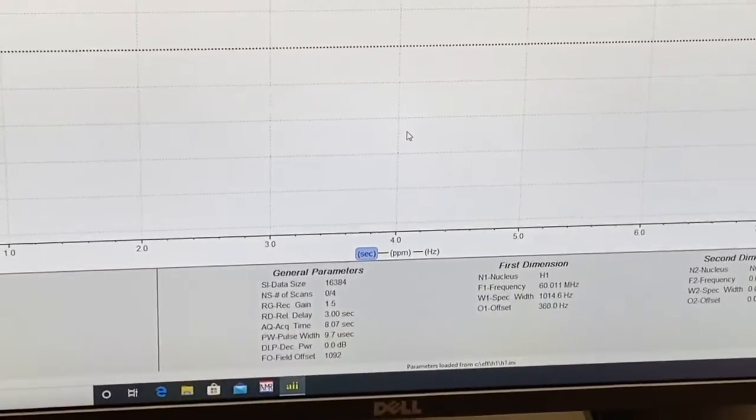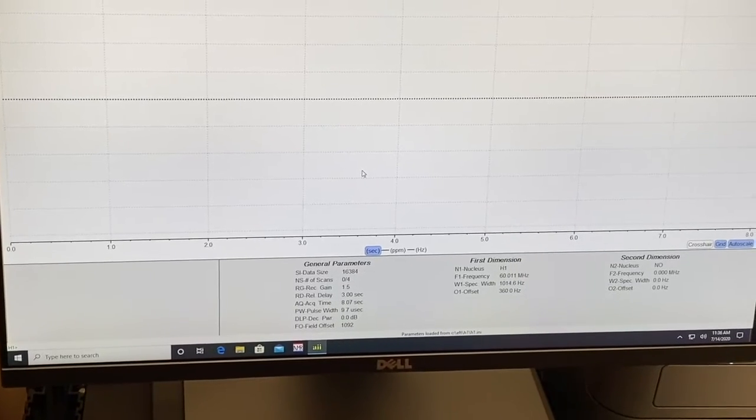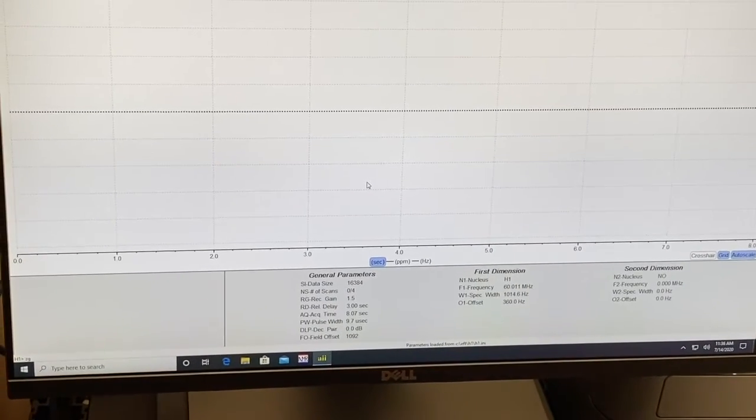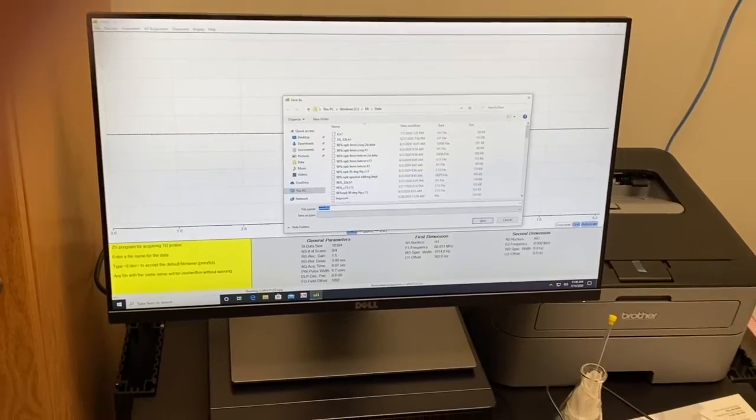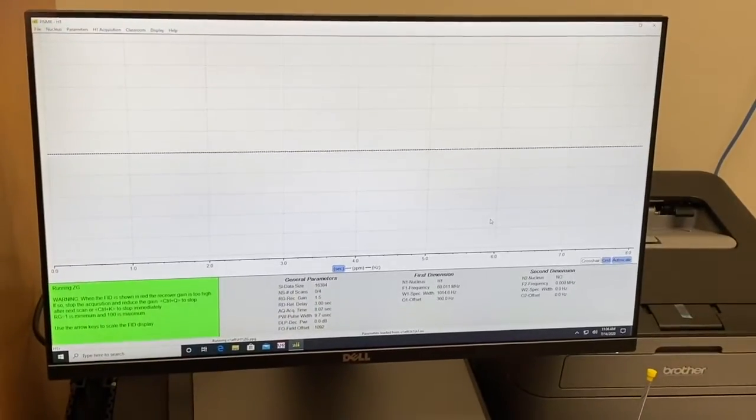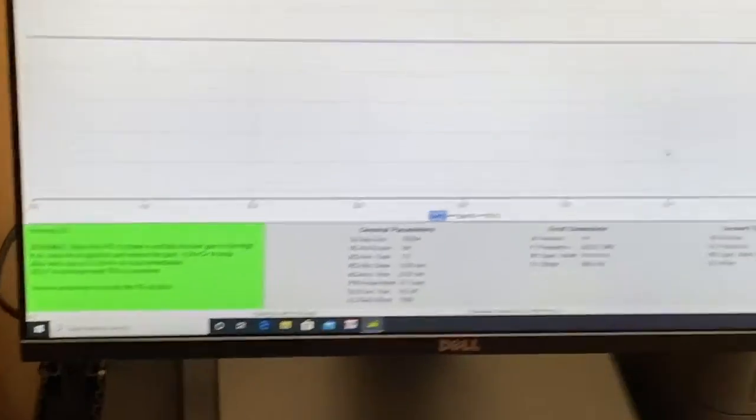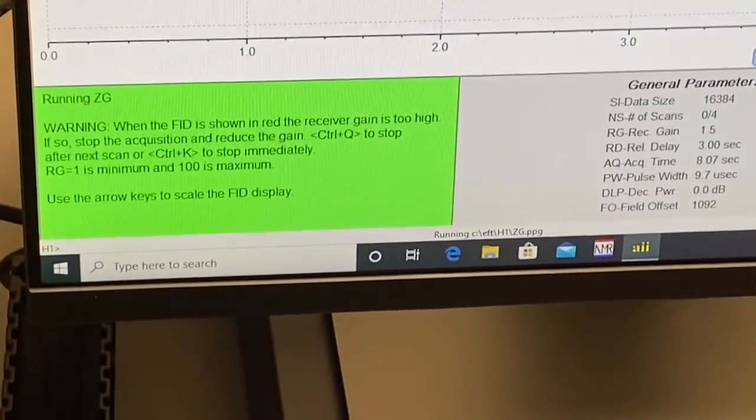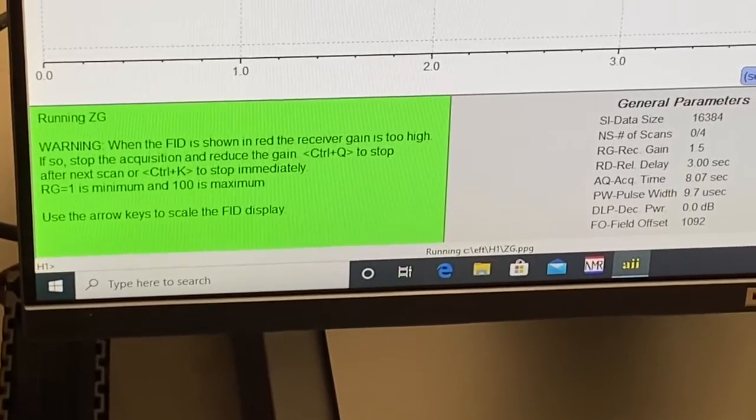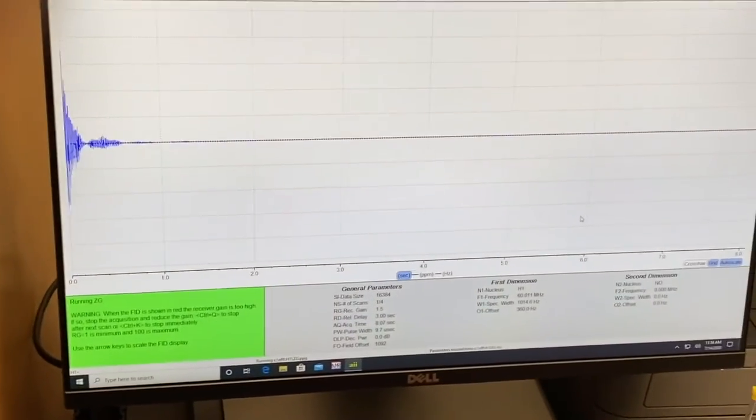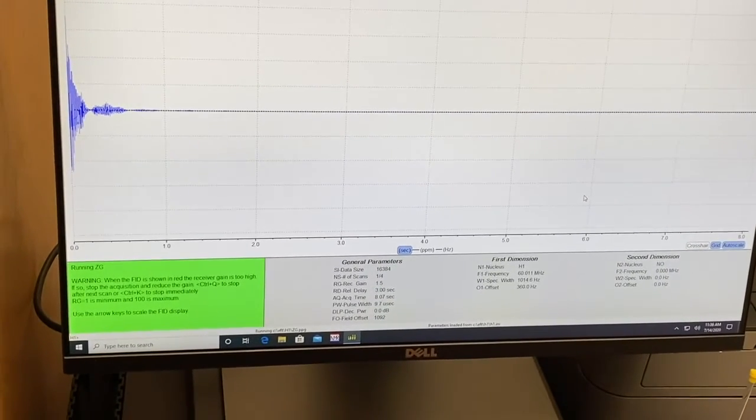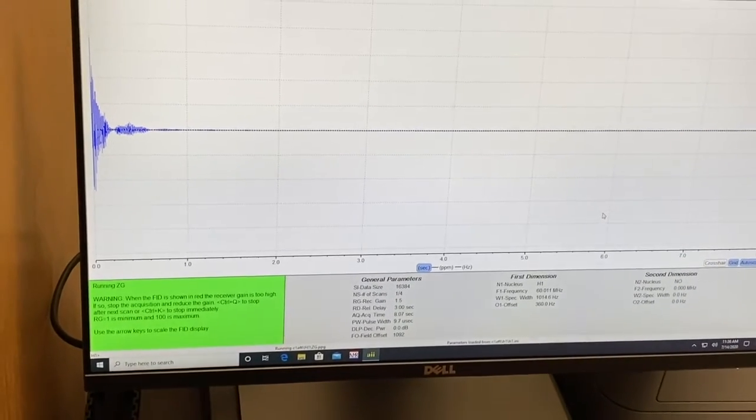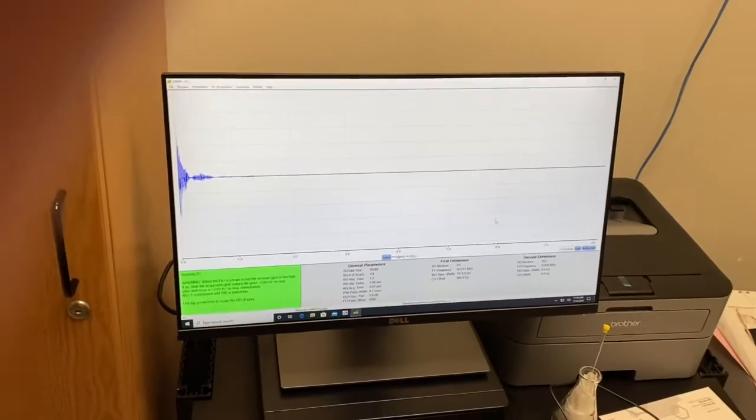Now you're ready to actually gather the spectrum. So you type ZG and then enter. Then just hit save and it will save it to a general data area. The little green box in the corner tells you that it's running ZG and it's going to show an NMR FID on the screen. You want to not do anything until that green box goes away signifying that it's done taking its scans.